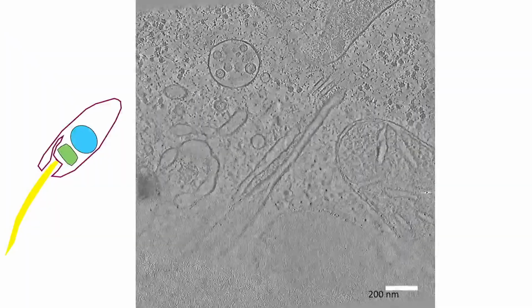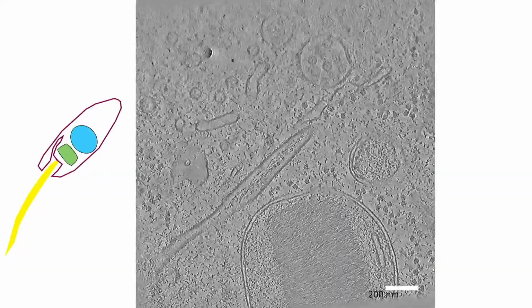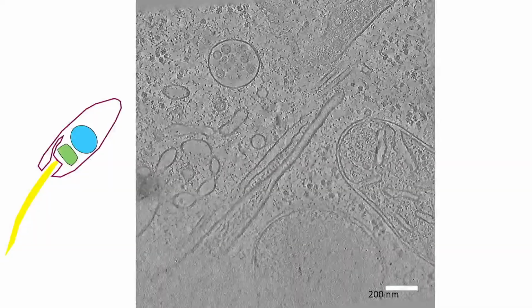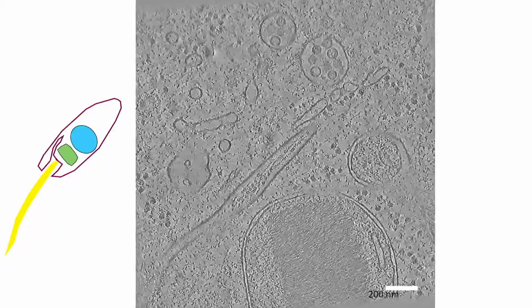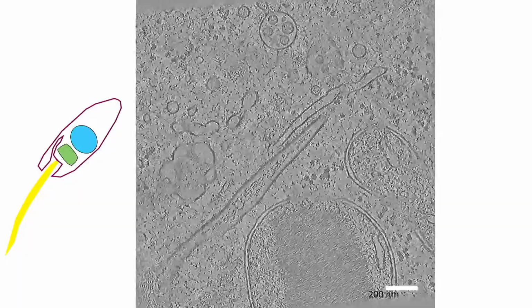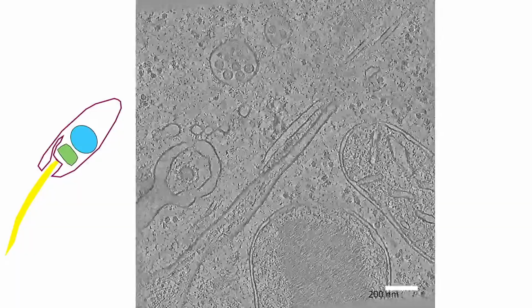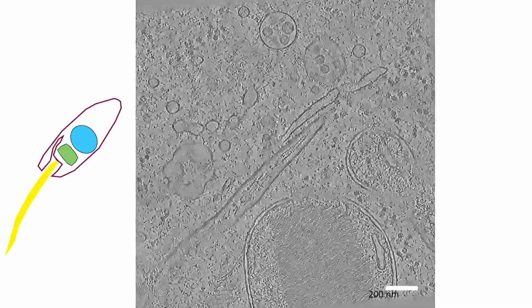And as you can see, we still see inside the invagination those filaments, those repeated structures that we have no idea what they could be. And many multivesicular bodies very close to this invagination, microtubules running along the invagination, as we already saw in Trypanosoma cruzi.